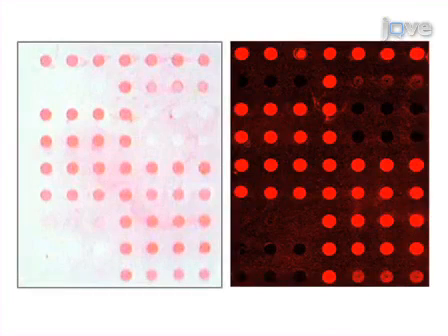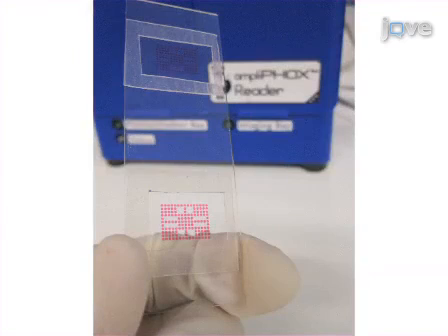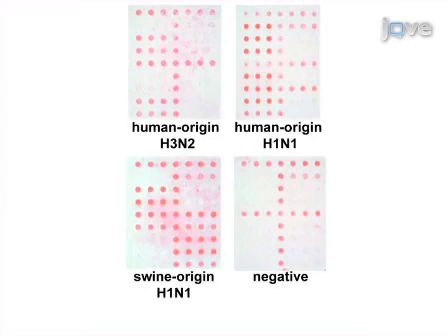The left image shows detection of a 2009 novel H1N1 specimen by AmpliFox, while the image on the right uses traditional fluorescence generated by a confocal fluorescence microarray scanner. The same overall detection pattern can be easily seen for both methods; however, the AmpliFox result is visible to the naked eye. These images show flu-chip results from a human origin H3N2, human origin H1N1, swine origin H1N1, and a negative AmpliFox array lacking detectable influenza A.